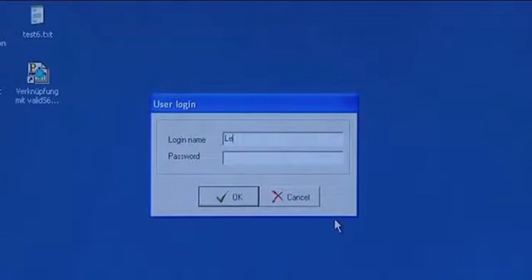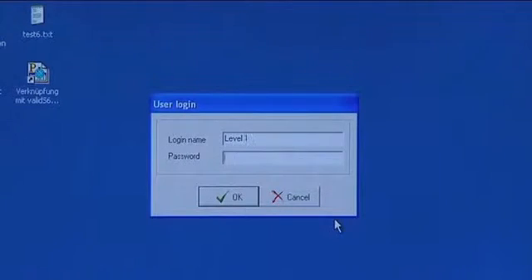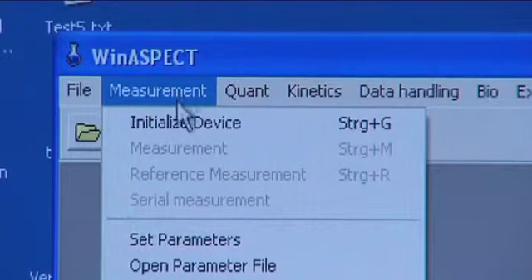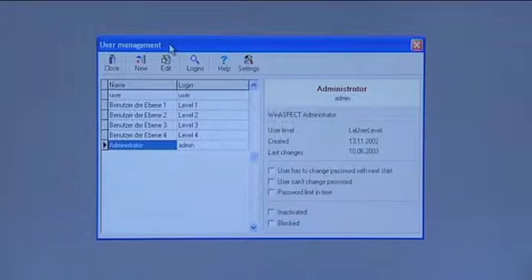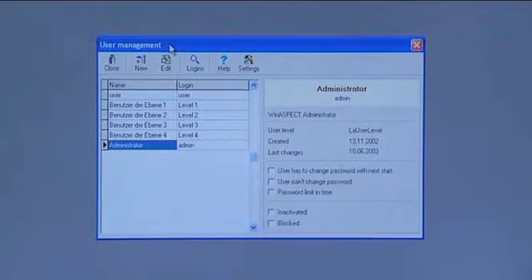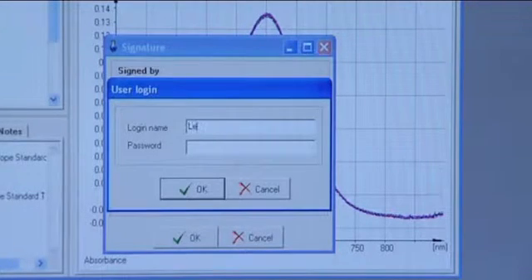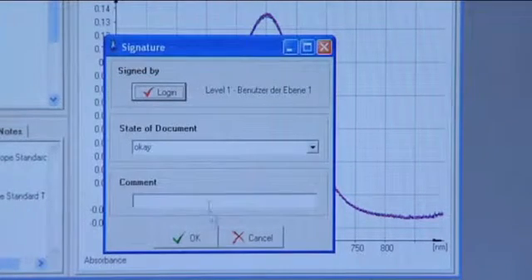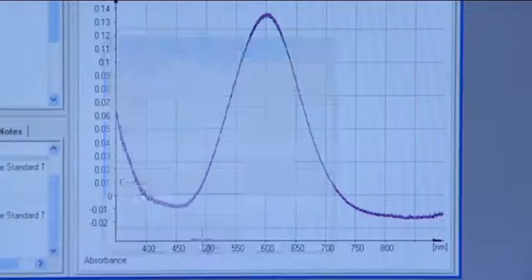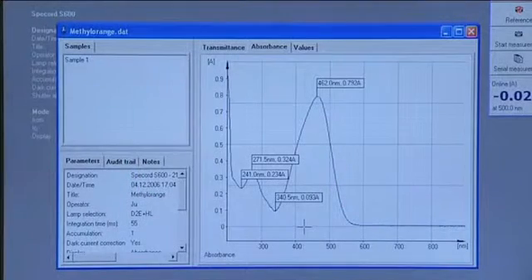The WinAspect software for PC control and evaluation of the Spicord S600 is impressively versatile, convenient, and with a clearly arranged user interface. A comprehensive user management, an electronic signature facility, and the audit trail satisfy the requirements of FDA 21 CFR Part 11. The features integrated in WinAspect ensure reliability, lucidity, and traceability of all actions throughout the measuring time.